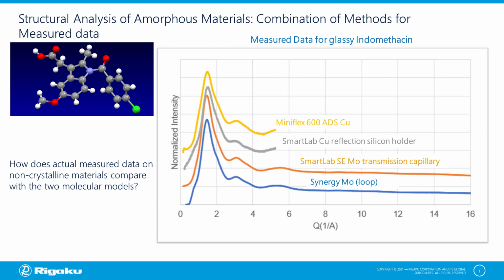And I think you'll agree that once we go through the data processing, all of this data, within the limits of the X-ray wavelength used, looks essentially the same. And that's one of the things we're trying to enable with a PDF platform, is that it doesn't matter which of the instruments you use, you'll be able to generate instrument-free data to calculate the PDF from.